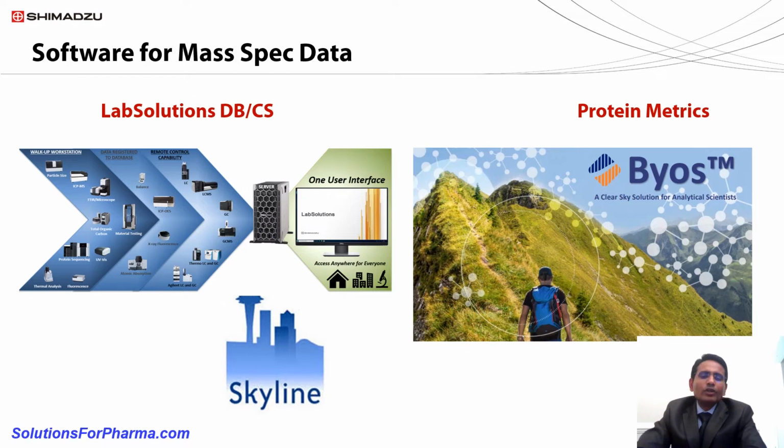But if you want to connect the entire laboratory, all instruments, to one server, that is LabSolutions client server, or LabSolutions CS. So all of your laboratory instruments can be connected under the same server. And then we used Protein Metrics software, our partner, to do the protein or mAb-based analysis using LCMS. We also use one of the open source softwares, which is Skyline, for the peptide MRM analysis.